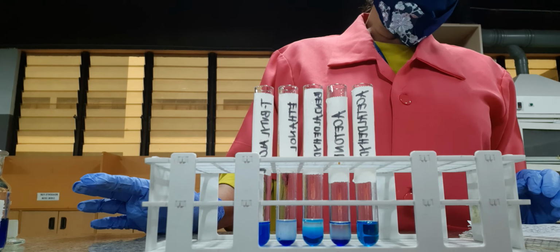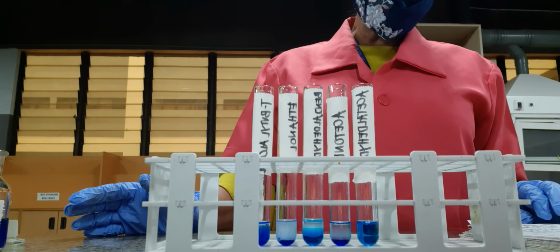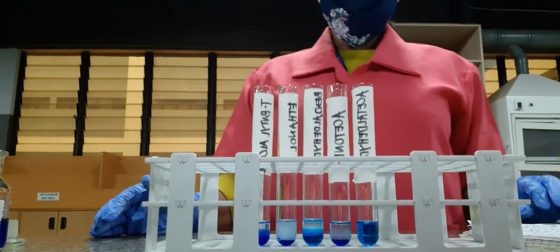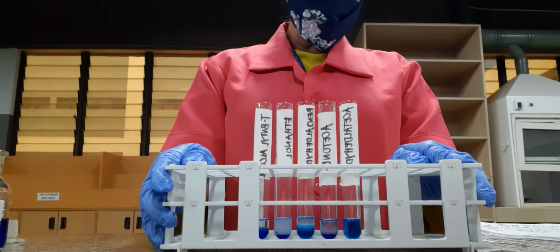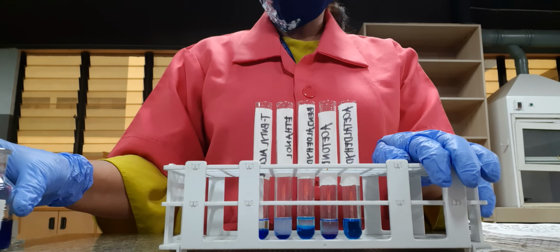Now take note that the positive test for this is the formation of a brick red precipitate. Okay? So we will allow this to undergo a warm bath under a water bath.